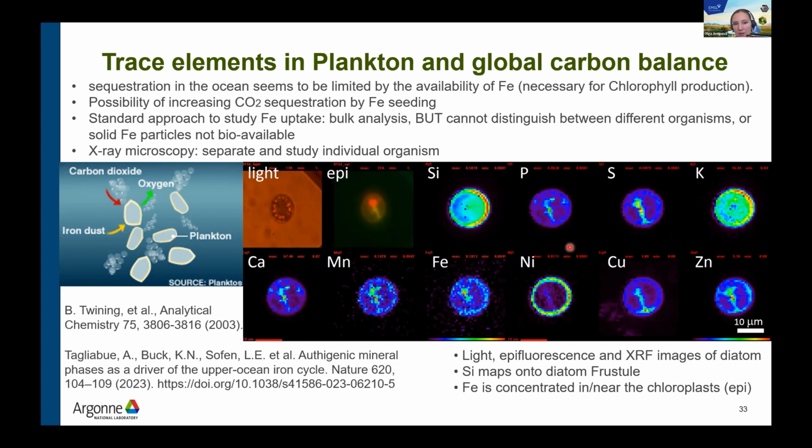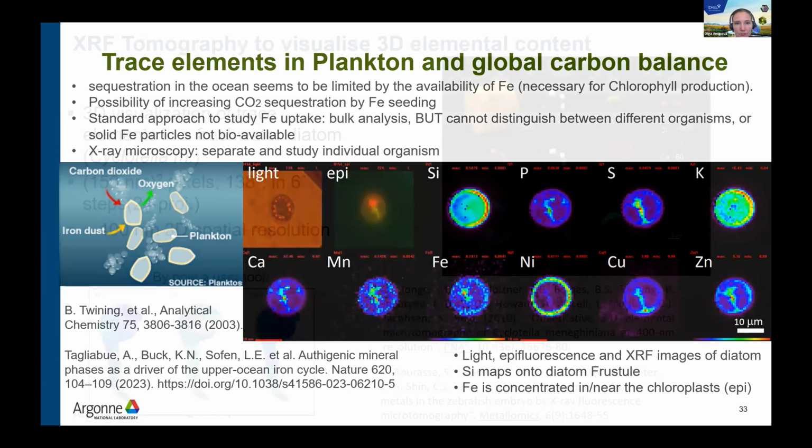So it's proven to be a very reliable tool to understand differences in nutrient uptake by the plankton in different zones of the ocean at different times of the year, with different kinds of pollutant presence in the medium. And recently they published a paper in Nature where they accumulated several years of studies on this subject using data provided by the synchrotron.